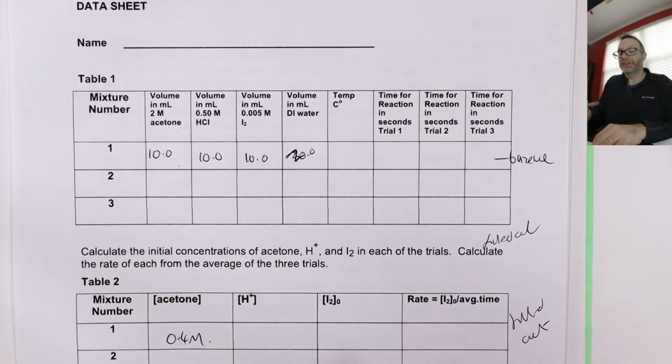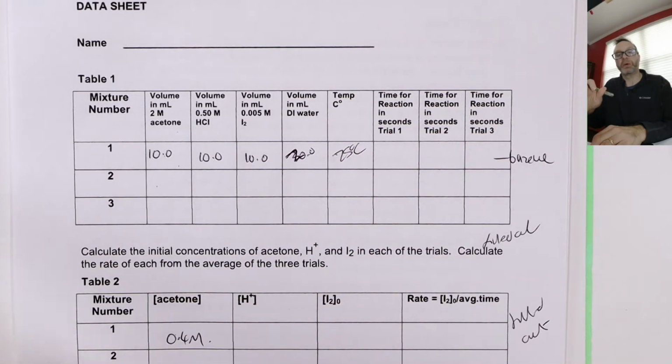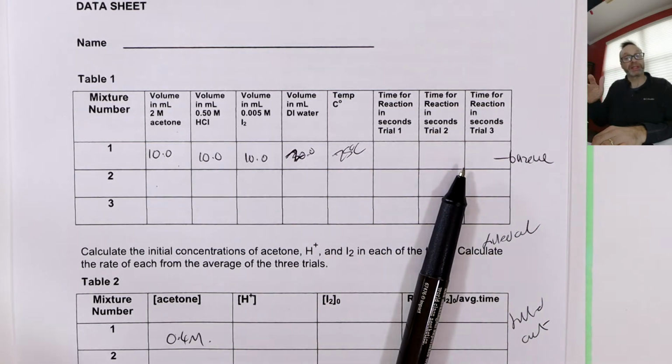Okay, all right. And then what we do, if you remember, is measure the temperature. It's probably 25 degrees C or thereabouts, whatever the lab temperature at the time was, okay? Now here, you do 3 trials. In lab, you'll do trials until you get within 20 seconds, right?